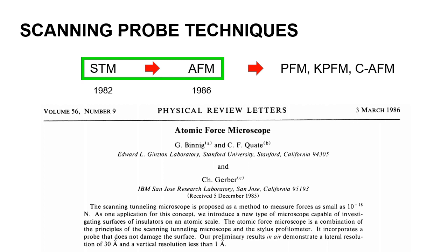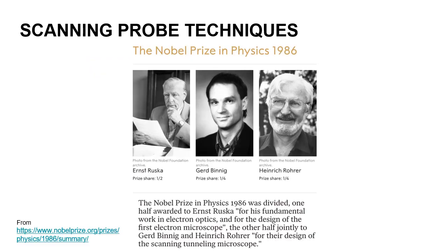Here you have the atomic force microscope original paper, and the first author was also awarded the Nobel Prize in 1986 for his participation in the development of the scanning tunneling microscope.